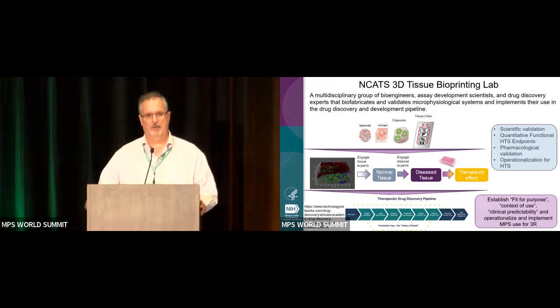There's been a lot of talk by previous speakers this morning, and debate, about how you assess that these tissues are physiologically relevant. It really depends on the questions that you're trying to ask, and what disease. The previous speaker gave a perfect example of that. Because we are very much HTS and screening focused, we're very interested in developing quantitative functional endpoints that we can use for screening.